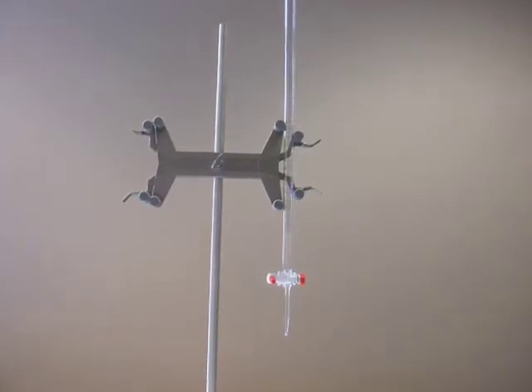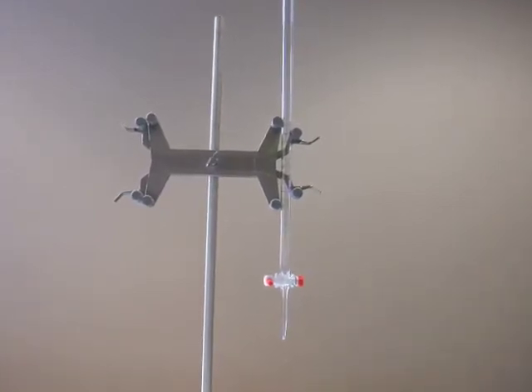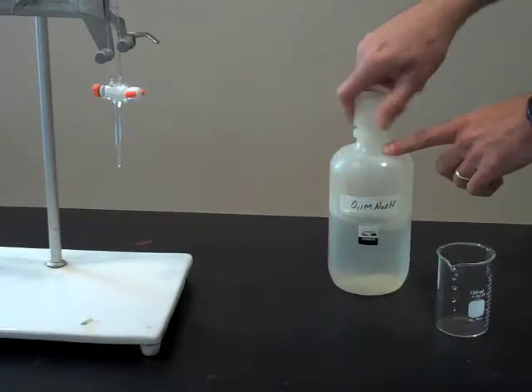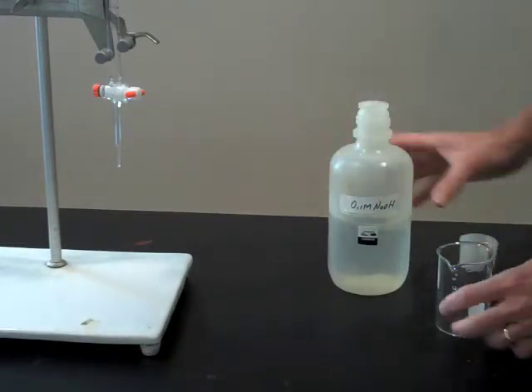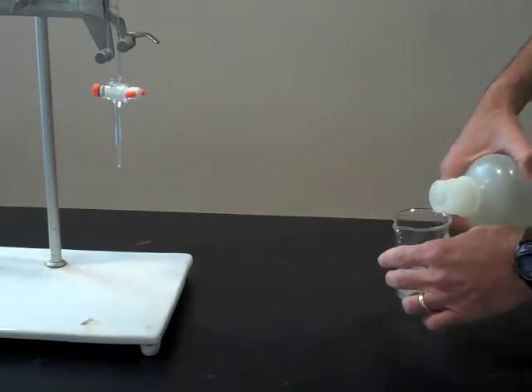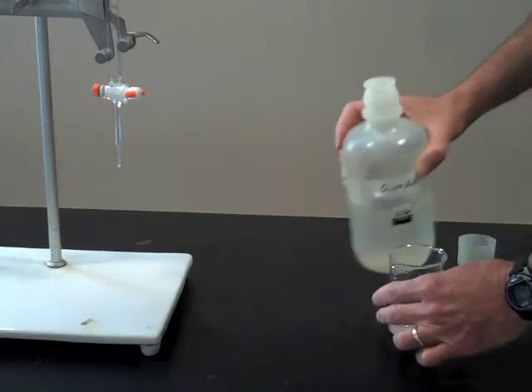Attach a burette clamp firmly to the stand and lock the burette into place. In this demonstration, we will be using sodium hydroxide to titrate a solution of acetic acid using phenolphthalein as a color indicator of the endpoint of the titration.